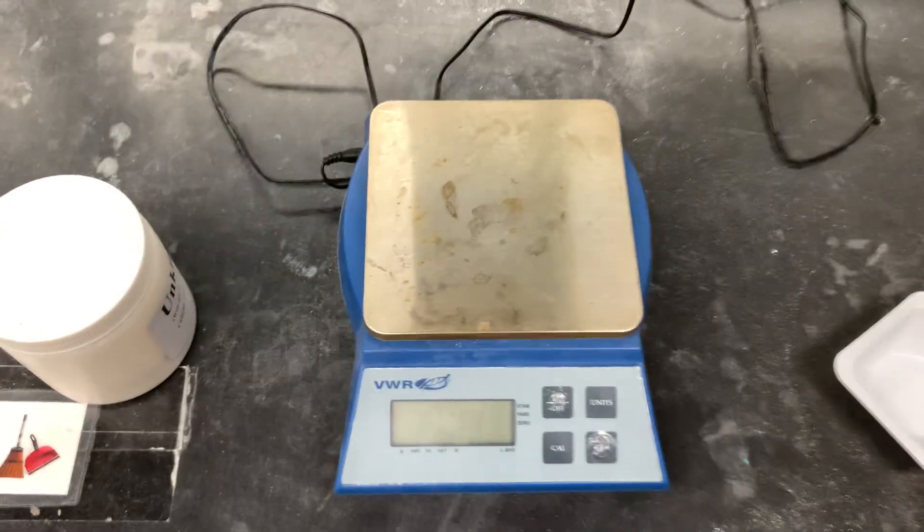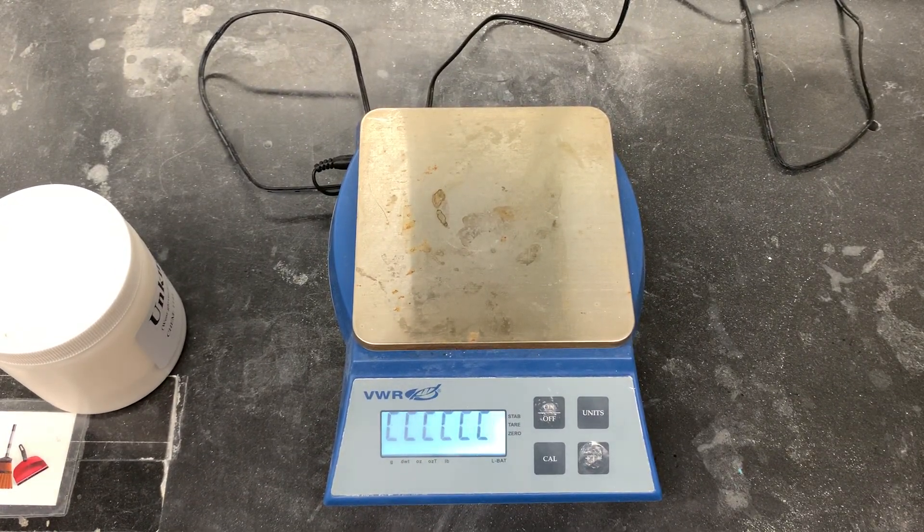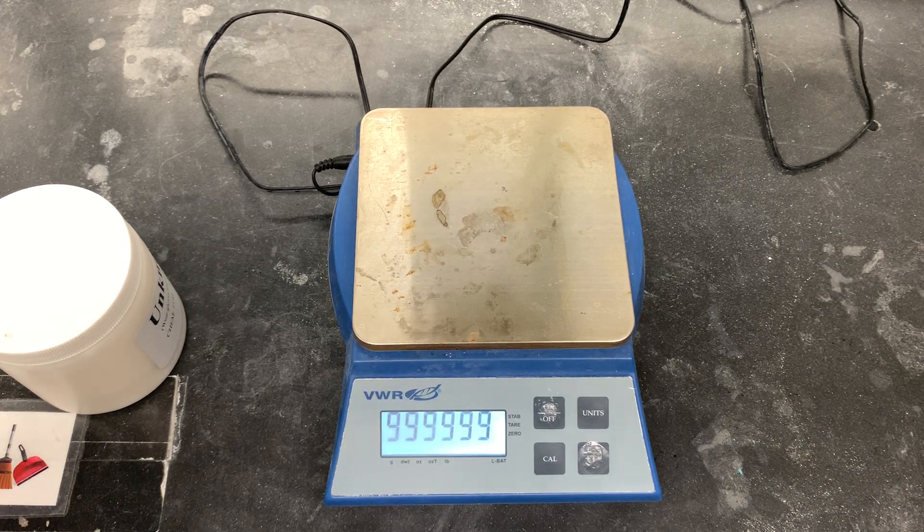The next thing that you're going to want to do is press on on your digital balance. It's going to go through the calibration steps, and once you've completed those calibration steps, it's going to read 0.00.